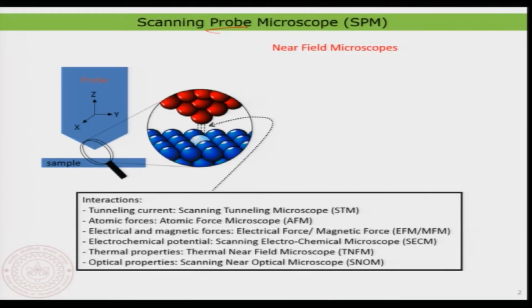They move across, and as soon as they find an obstacle, they move the probe over it. That is identifying, or probing, the surface along which they are walking. The same idea is what we use in scanning probe microscopy.